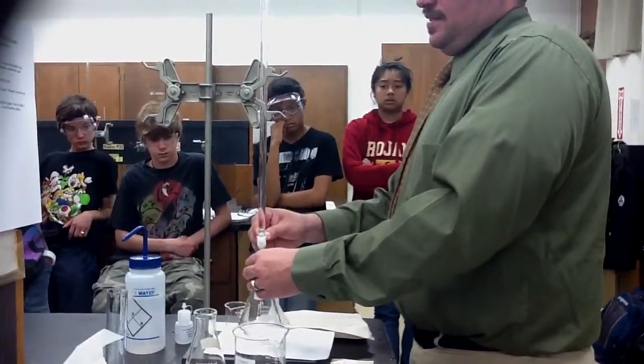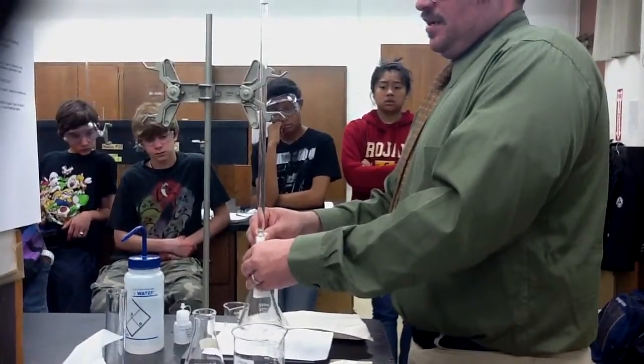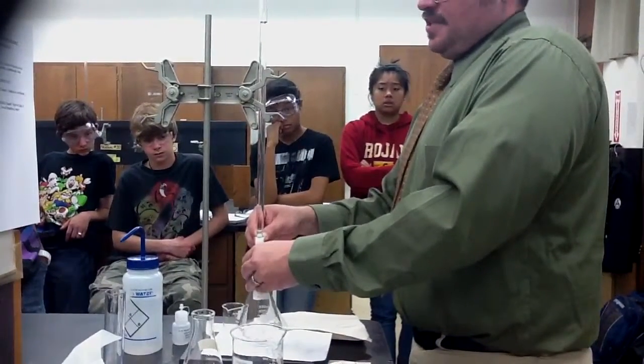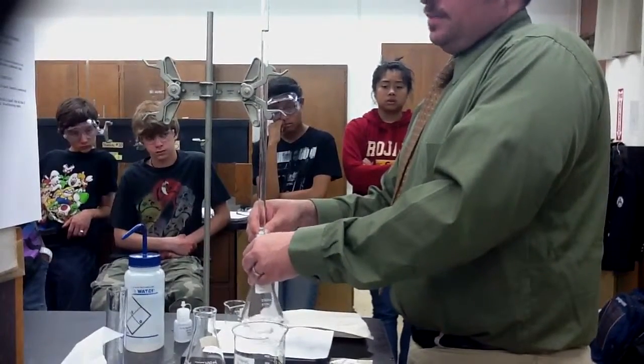Alright. In the beginning, we can go fast and I can just stir it up like this. As you start getting closer to the end point, the solution will start to remain this pale pink color.